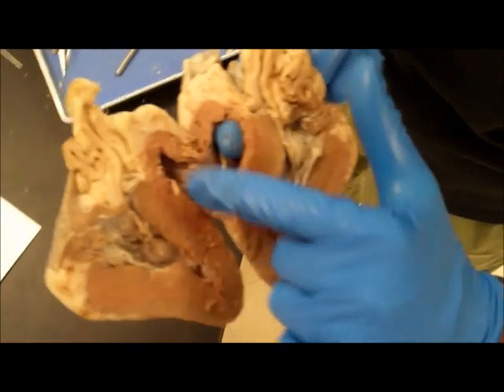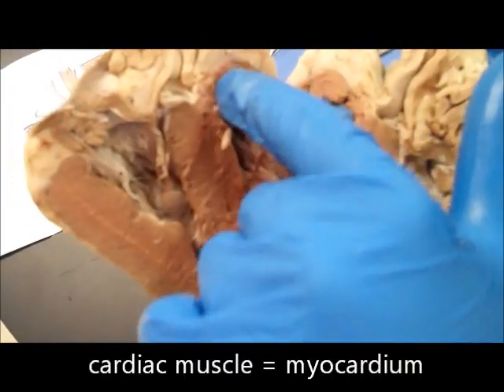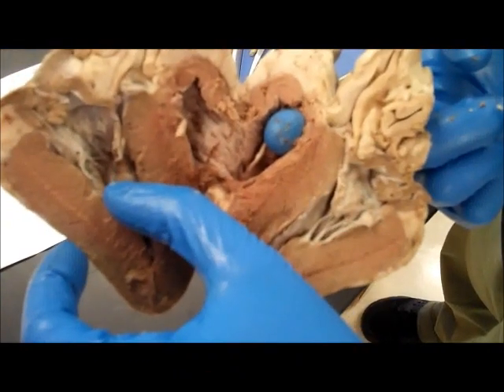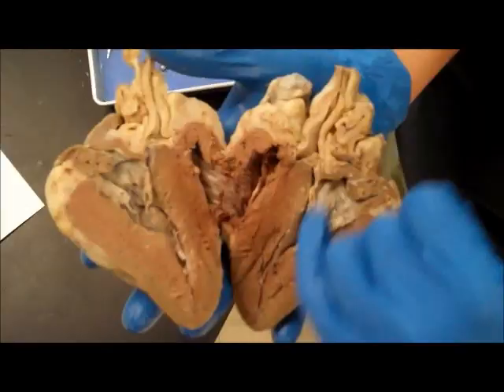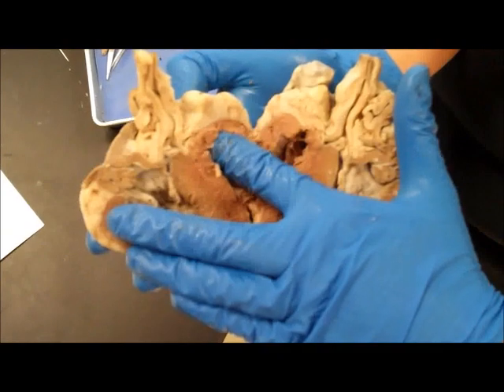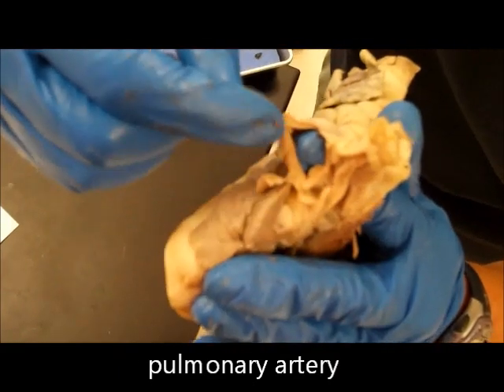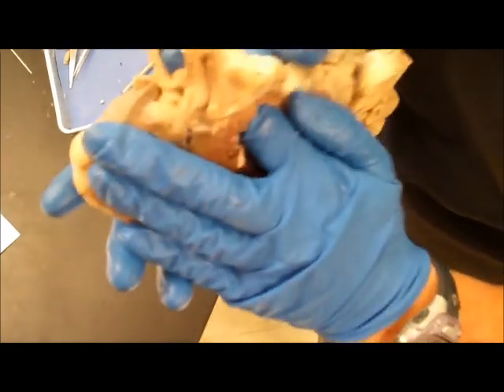And notice that the cardiac muscle that composes the right ventricle is the wall. The walls are much thinner than we're going to see later when we get to the left ventricle. Okay, so now we're back in the right ventricle. Through the right ventricle, the blood will flow into the pulmonary arteries, and again, notice the artery has a much thicker wall than what we saw with the veins.